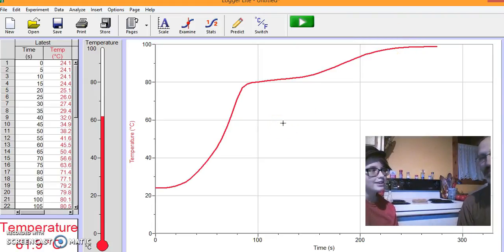Oh, interesting. I think because it didn't occur to me that there were two things in there. But we talked about it being a mixture, and we talked about the two boiling points. Yeah, and now I understand. So the flat spots kind of correspond to the boiling point, don't they? Yeah, almost exactly. That's where the alcohol boiled, and that's where the water boiled.